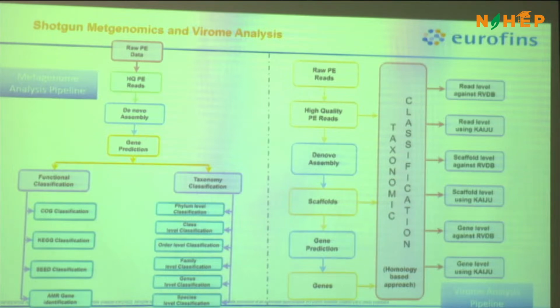So when we are doing whole metagenomics, we can get a deeper insight into the particular samples along with other components of functional categories, where I know which gene is going where and which pathways they are associated with. All this information is possible because we have the entire DNA.